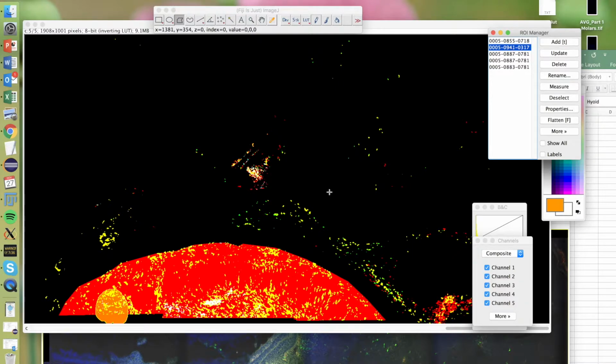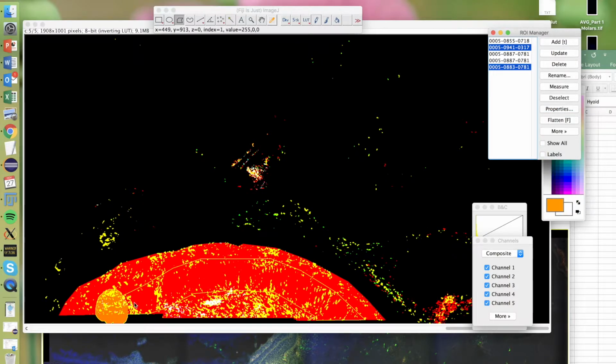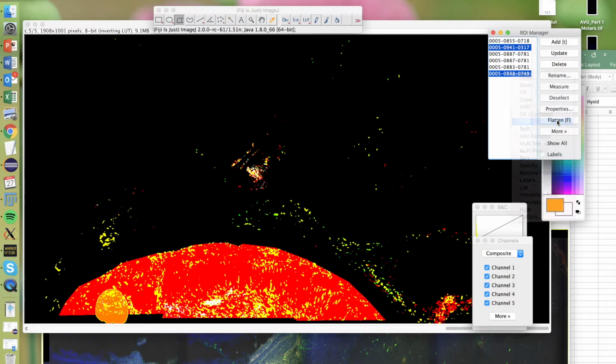So to remove an overlap like that, it's a little bit annoying. What you've got to do is select the shapes that you want to remove the overlap from, and actually combine them into this, rather, let's be nice and call it a mushroom shape. And so now we have the areas combined, and then select the one you want to take away, and this combined one, and use XOR.